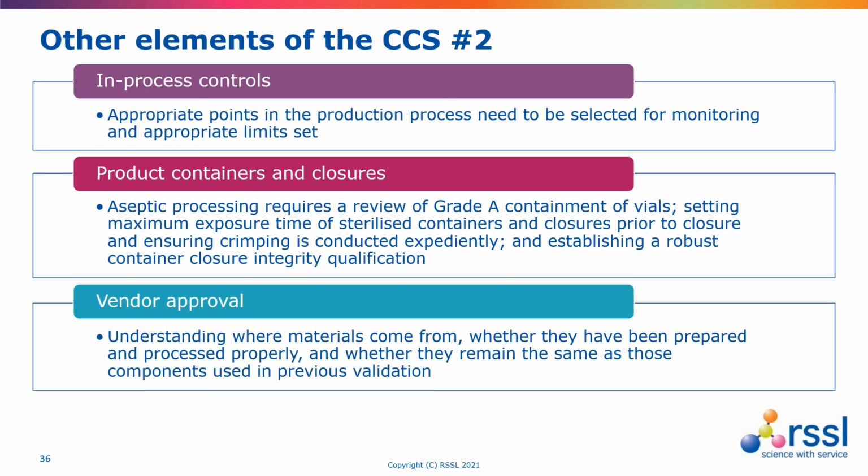How we onboard vendors, and if the vendors, say, are providing something that's supposed to be sterile, like a garment or a piece of tubing, whether we have an understanding of that vendor's sterilization process and whether that forms part of the audit.